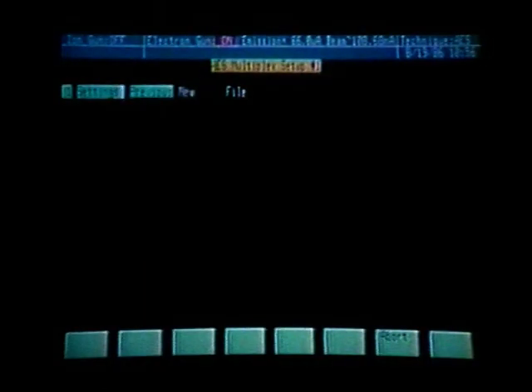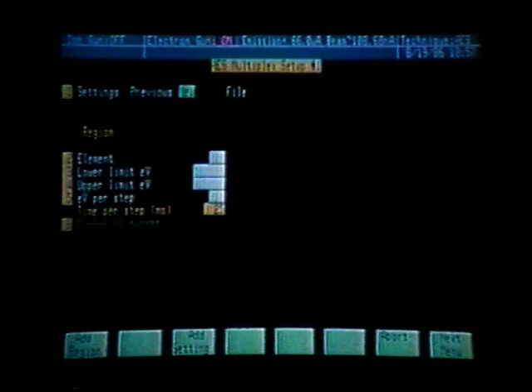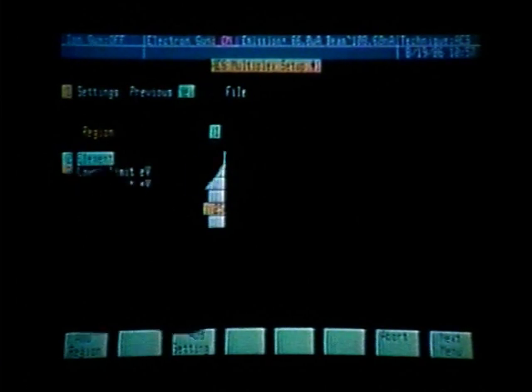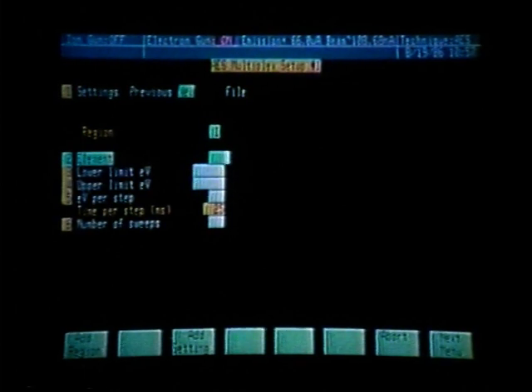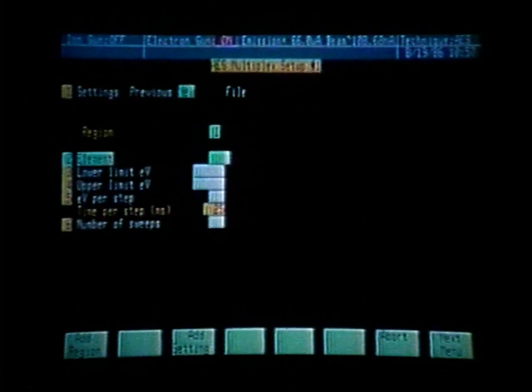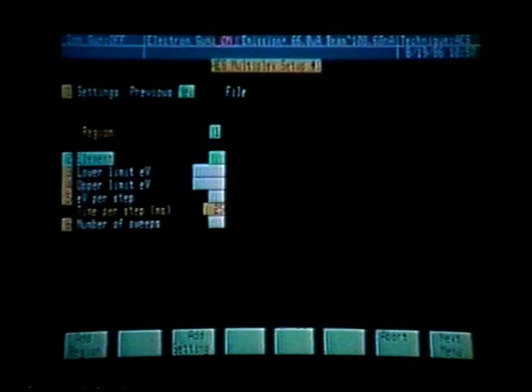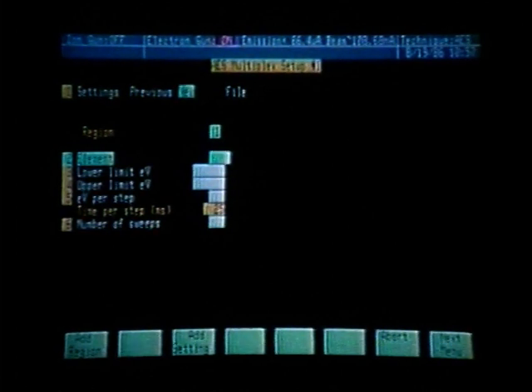What we would like to do here is define new settings. So by pressing function key number one, we can toggle to new and enter that. We now see that we can enter an element for region number one. We then will see the lower limit, upper limit, EV per step, and the number of sweeps. All of these parameters are stored in the tables mode and can be changed by entering the element table for the parameters the operator would like to use.